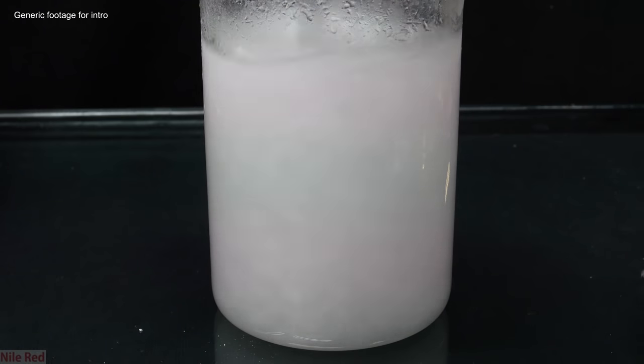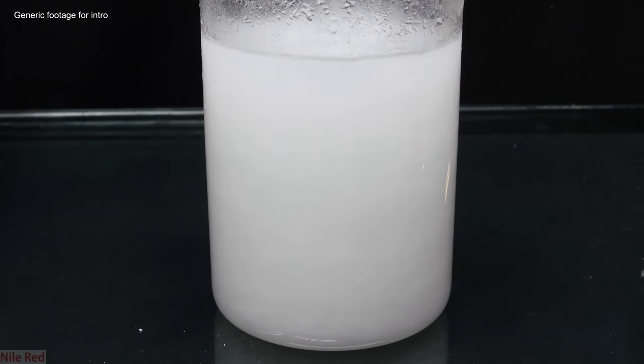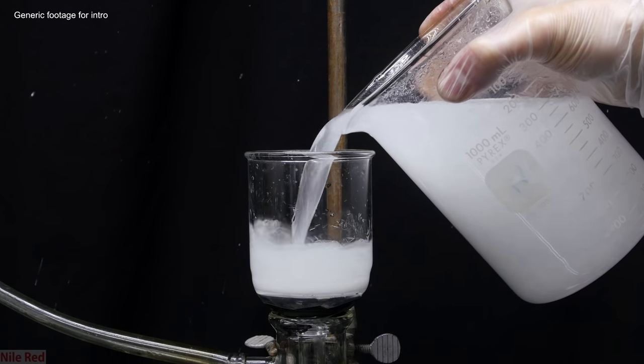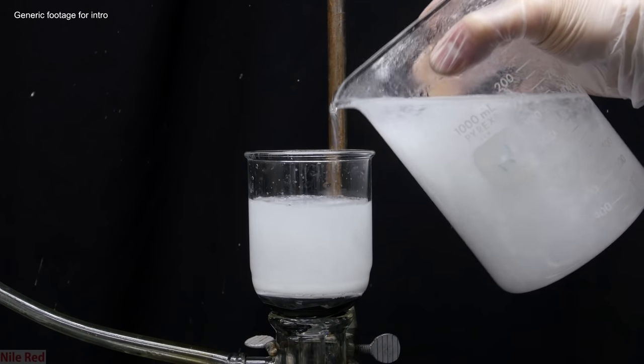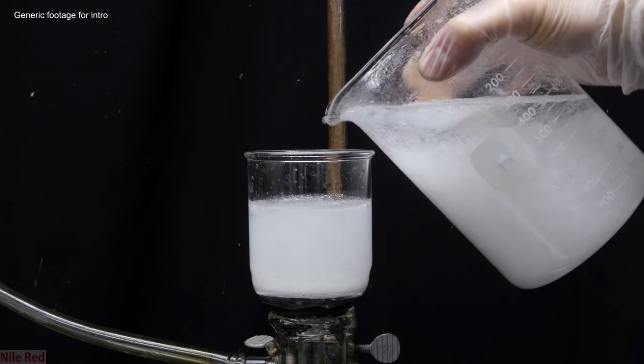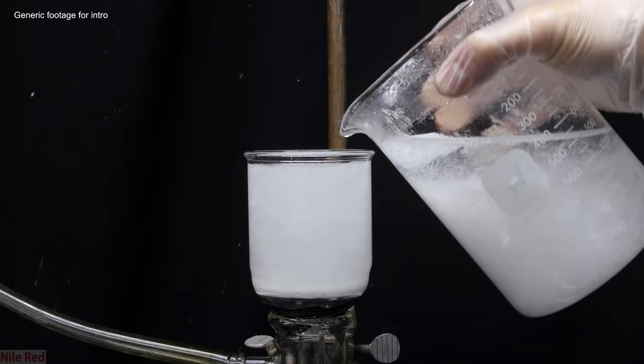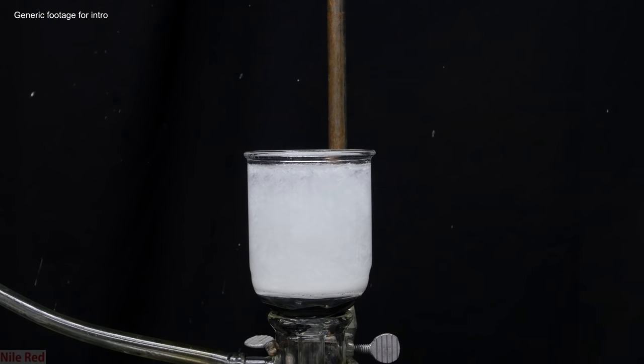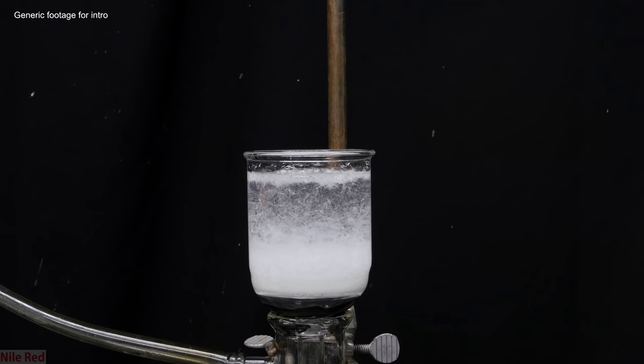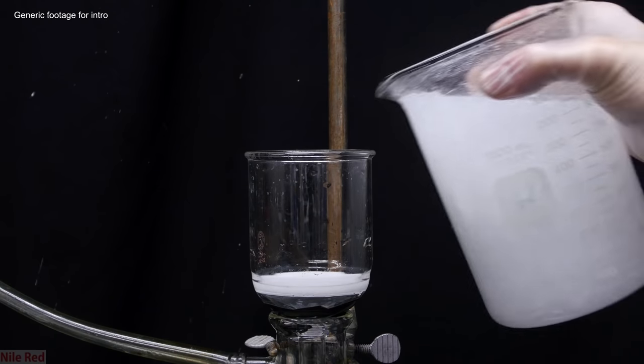The method involving a solvent mixture can be done in two main ways. The first method is we have a constant proportion of solvent A mixed with solvent B, and we carry out the recrystallization as normal. Normal meaning we do the exact same thing as we would if we used just a single solvent. Which means we dissolve the compound of interest, we heat it up, and then we let it cool and have crystals form.